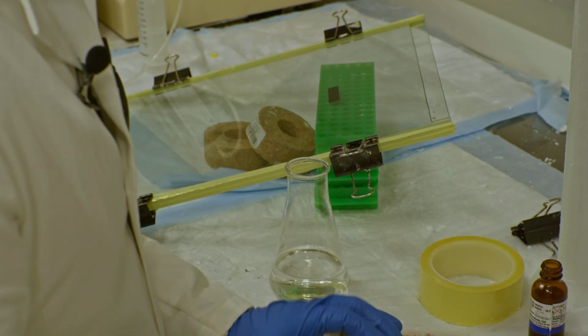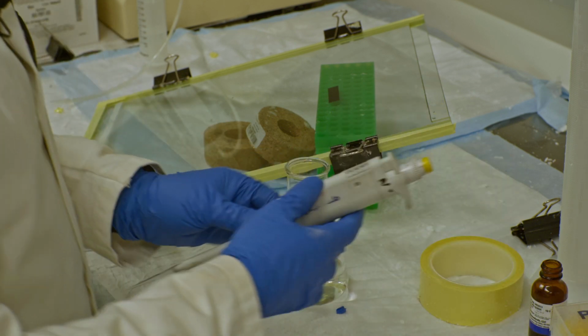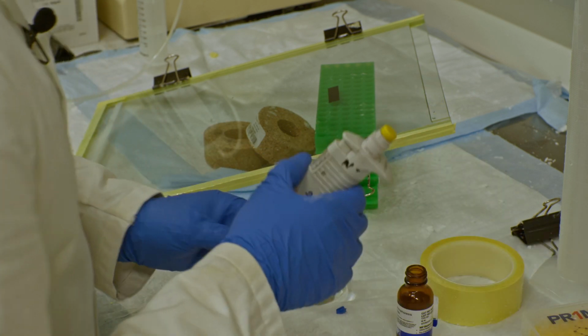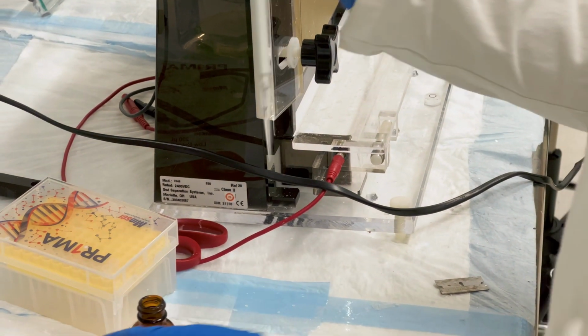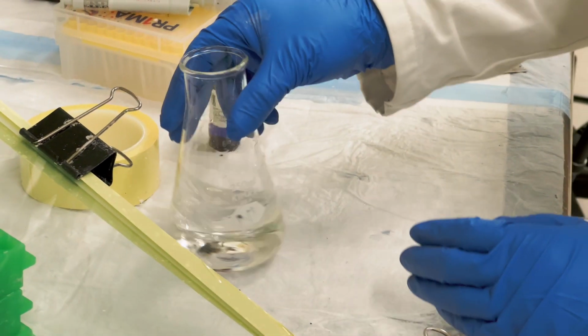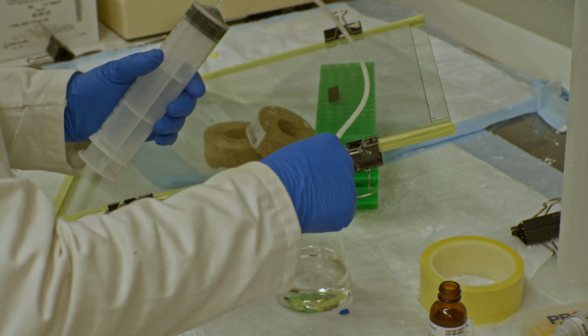Next, I add 85 microliters of this TEMED solution. If for any reason this TEMED solution causes too quick of a polymerization, you can use a different amount. Maybe try 5 microliters less. We add the solution, we swirl it a little bit, and then we start.